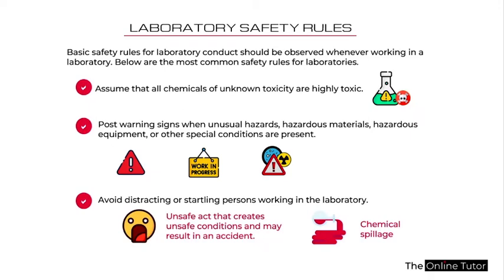If you startle someone who is working, and you suddenly shout the person's name, the person may get startled, and that will create an unsafe act, which creates unsafe conditions and may result in an accident in the lab. A potential accident that can happen is chemical spillage.